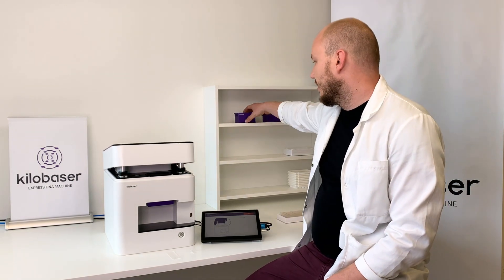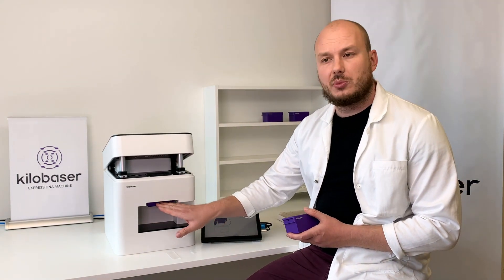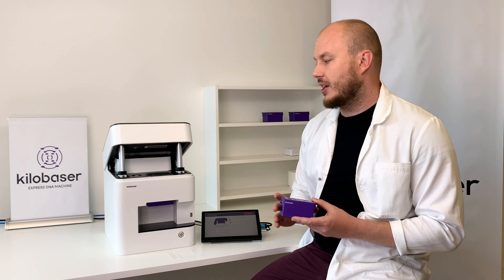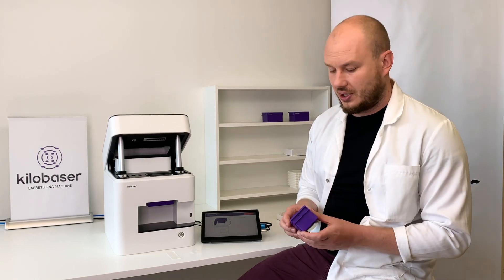For the system we have two disposables. First is the reagent cartridge. In our case the cartridge is already on the machine. It has material for about 200 bases, so for every couple of primers you synthesize you have to change the cartridge, which is also a really simple process.